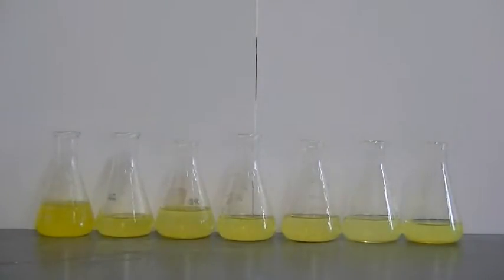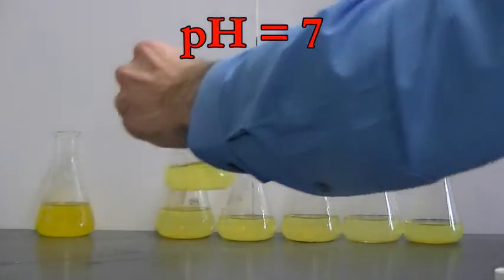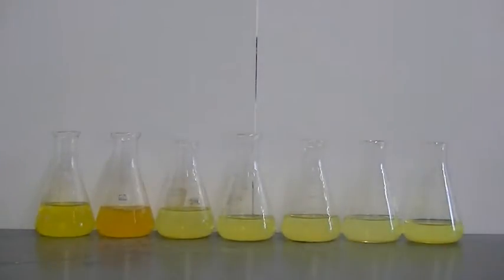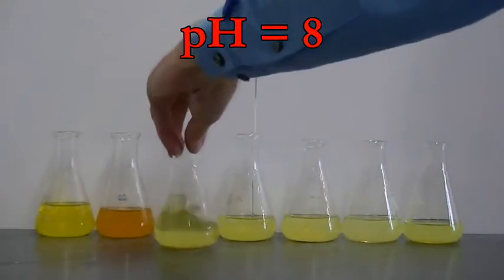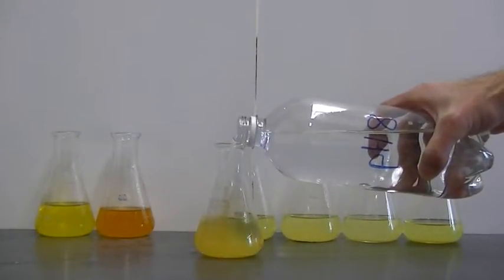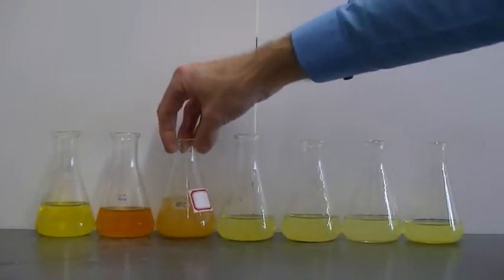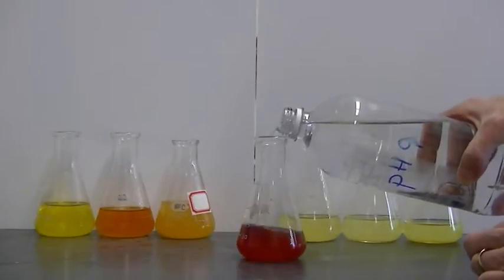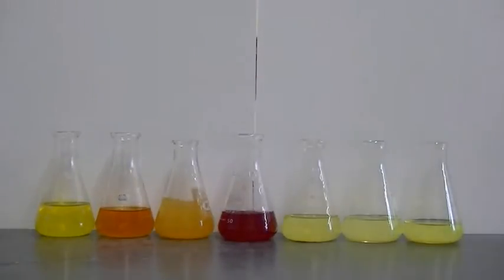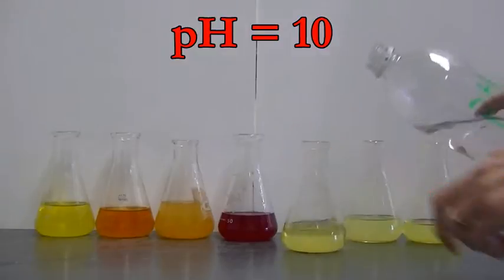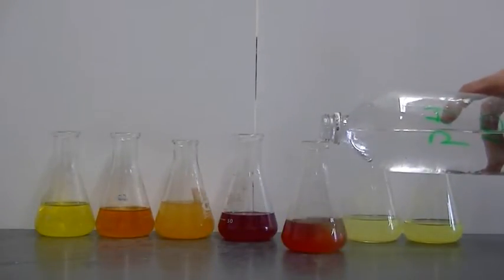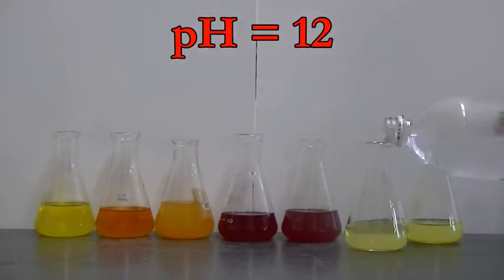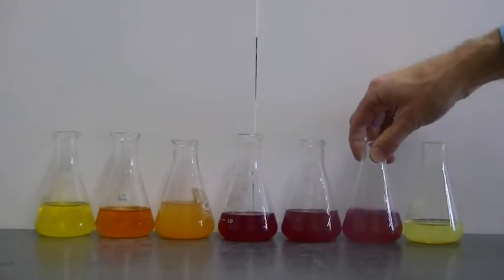Into the second flask, I'm going to pour some buffer at pH 7. To the next flask, I'll pour some buffer at pH 8. Next pH 9. pH 10. pH 12. And finally, pH 14.